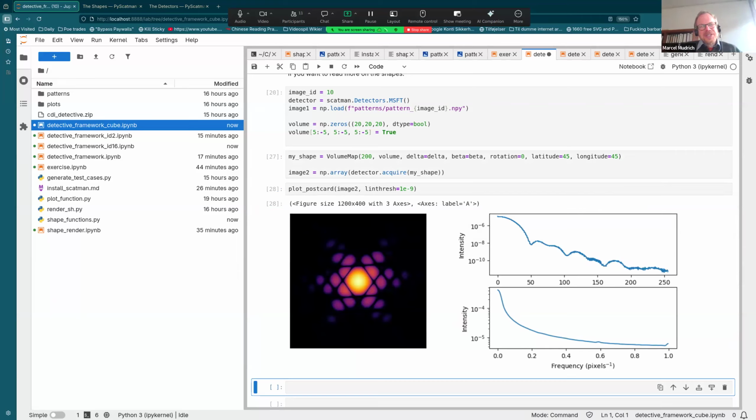This already gives an impression that when you do this diffraction imaging on some micro or nanocrystalline structures, if you really want to figure out and be sure what the actual real space structure is, it takes many different snapshots for many different orientations, right?